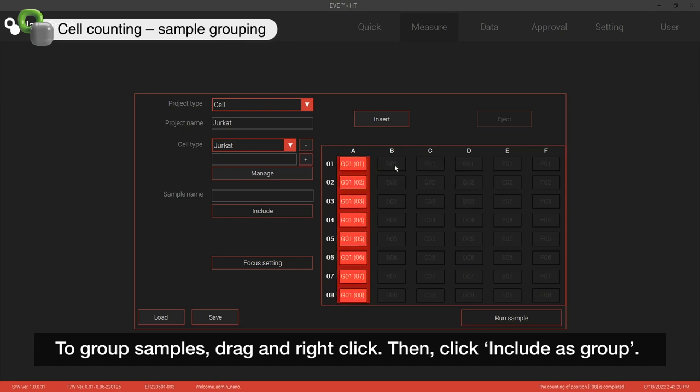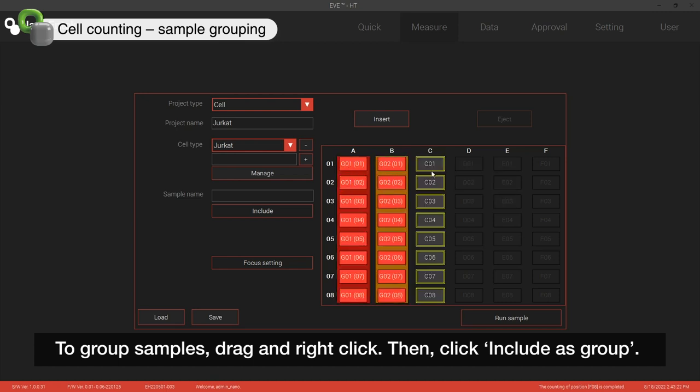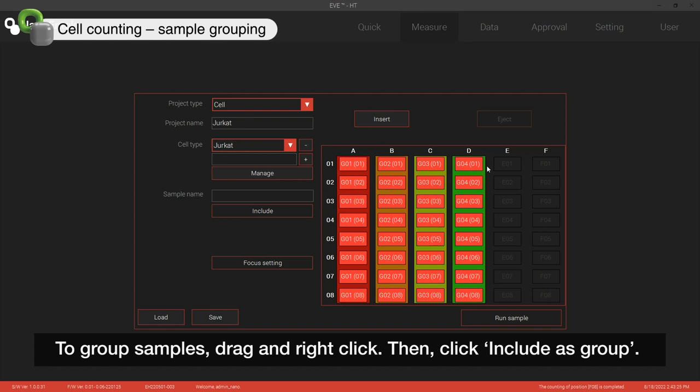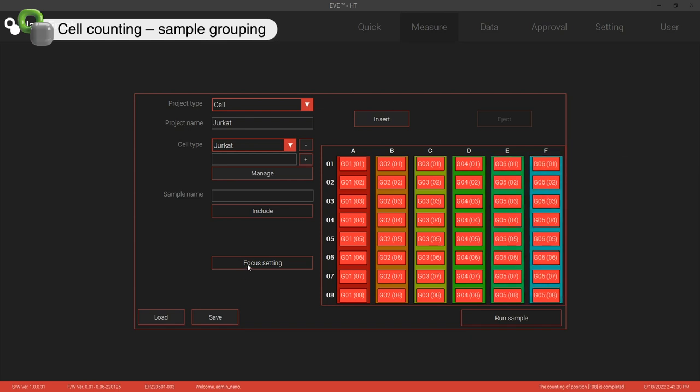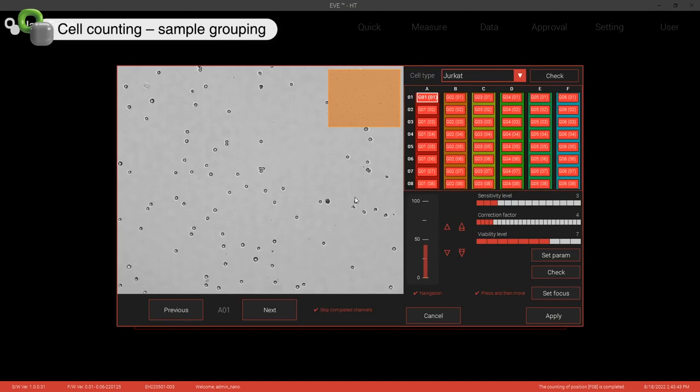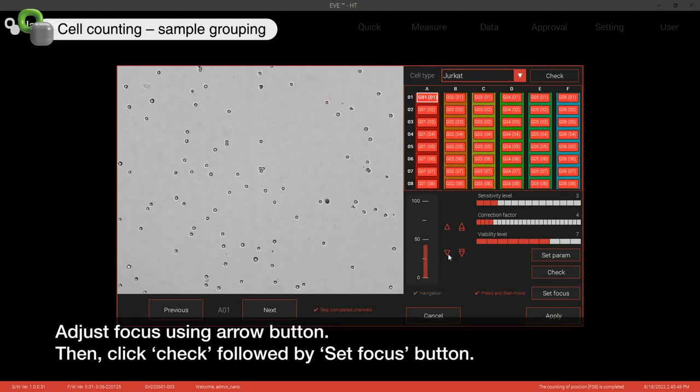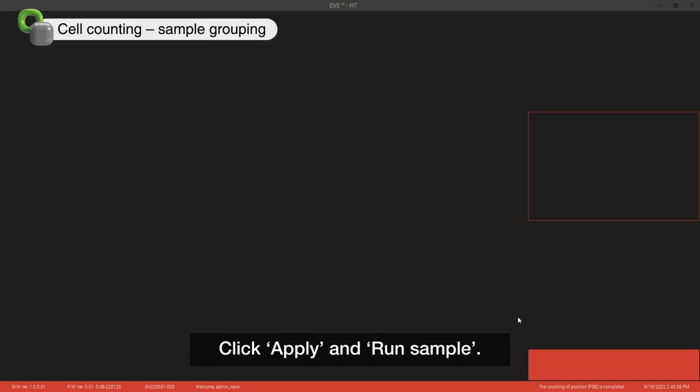To group samples, drag and right click. Then click Include as Group. Adjust focus using arrow button. Then click Check followed by Set Focus button. Click Apply and Run Sample button.